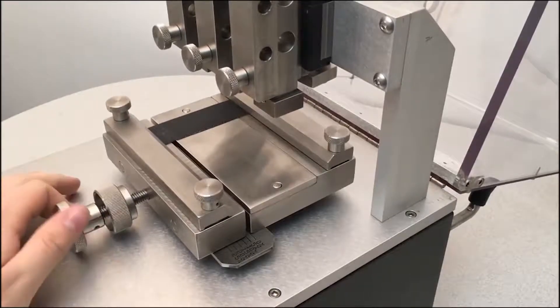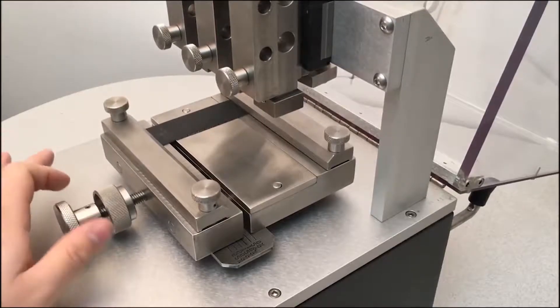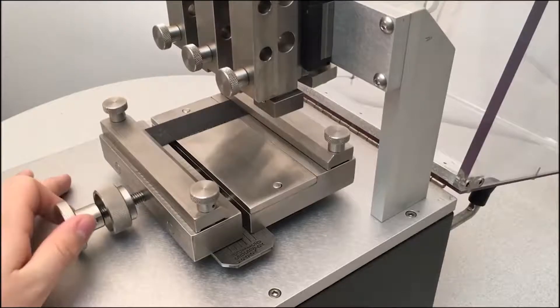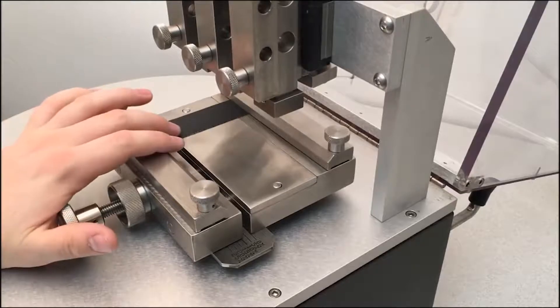You adjust the stretch by turning this outside screw with your hand, and move it up to 10%. Then you lock it in by turning the inside screw all the way up against it.